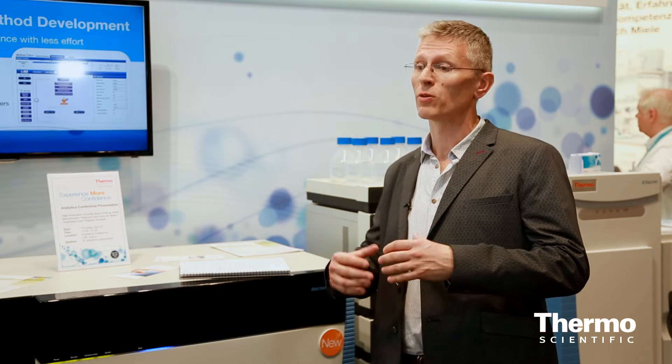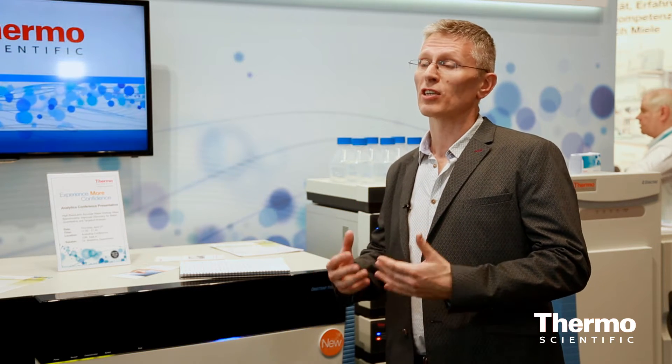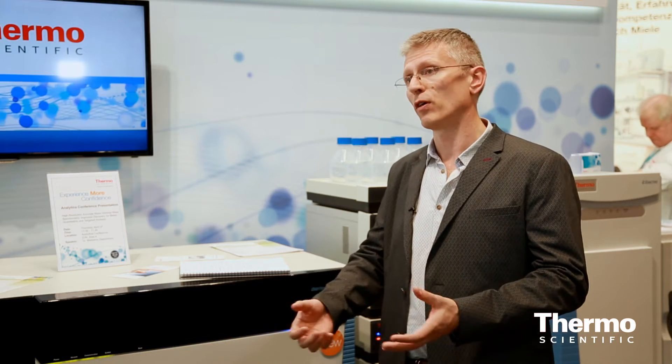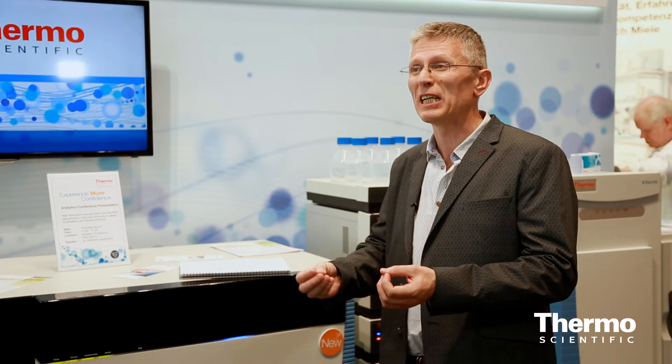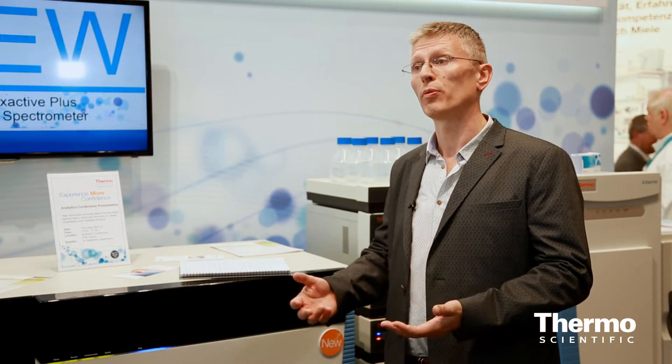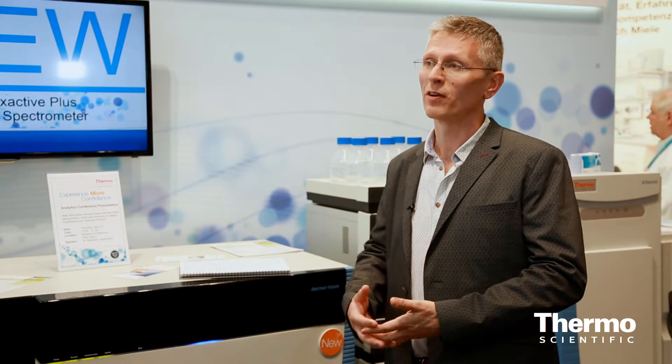Having said it's easy to use, it's still a very flexible instrument that allows a range of instrumental designs. You can optimize the way you acquire data for a shotgun proteomic sample in a really small amount of sample. You can perform optimized analysis of a phosphoproteome, of glycans, of lipids and so on. The instrument actually comes with these methods ready to use for these different types of samples.